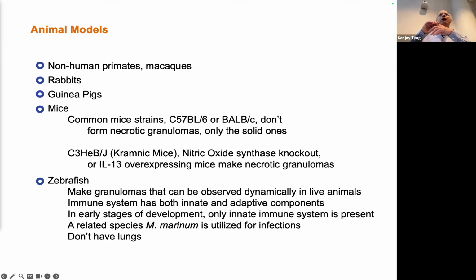So in about 2017, Lambo and Selva came to me and said, can we image granulomas with single molecule FISH? Basically, TB, of course, should be studied in humans, but the tissue is not accessible. So people use, since the very beginning, these animals. Primates make granulomas and have a TB disease that's very close to human. Rabbits are models that mimic the human granuloma pretty well.